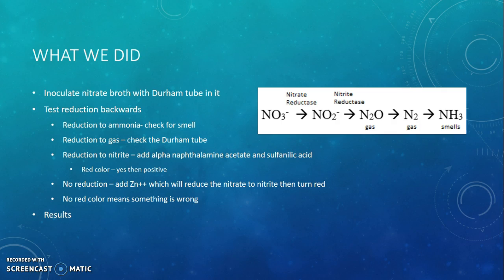So what we did was we tested for reduction. We inoculated nitrate broth. We had a nitrate broth tube, and it had a Durham tube in it. It has this nitrate, NO3 minus, in it. And we inoculated it with microorganisms. And what we did was we tested.